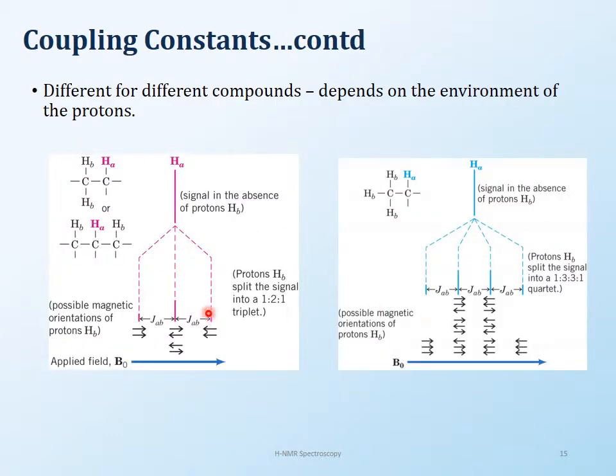So different compounds will give you different coupling constants. You saw these two splittings before. But I just want to mention that if you have a compound like this, where you had Cls over here, this proton is in a different environment than this proton which has CH3s over here, and if there were two chlorines over here, it would be a different environment for it.